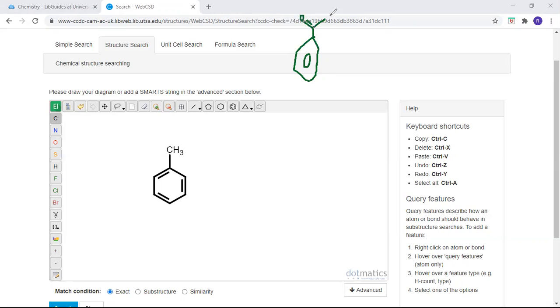Then we have this carboxylate group. So that's what I'm drawing in this structure. All right. So now it's okay, it's all carbons now. We'll show you how we fix that in just a second.